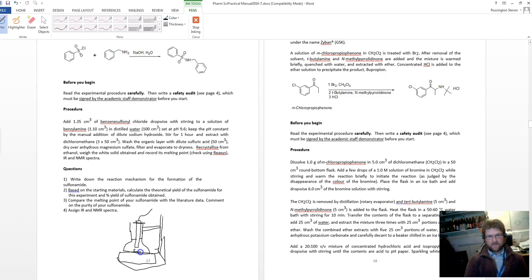So when you had your magnetic flea in position, which I'll show here, the magnetic flea does not want to be contacting the electrode and causing it damage. So you clamp the electrode above the level of spin of the flea, so the bottom of the electrode is submerged by the water, the benzylamine, the sulphonyl chloride.